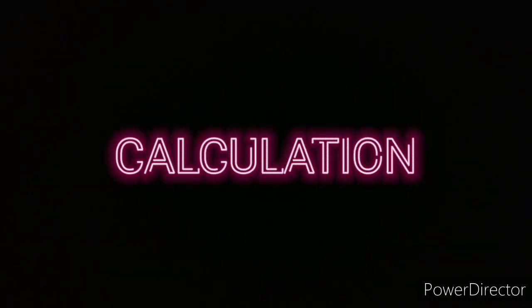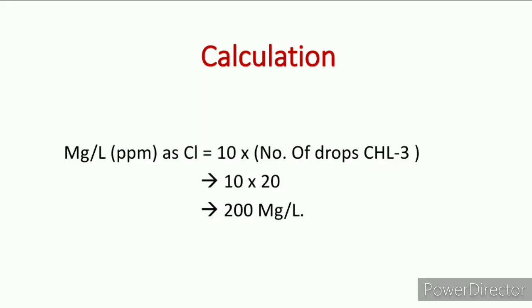We have to calculate the chloride content of our water. The formula is: mg/L as Cl = 10 × (number of drops of CHL-3). We added 20 drops, so 10 × 20 = 200 mg/L. In one liter, the chloride content is 200 mg. This is the calculation of our chloride content.